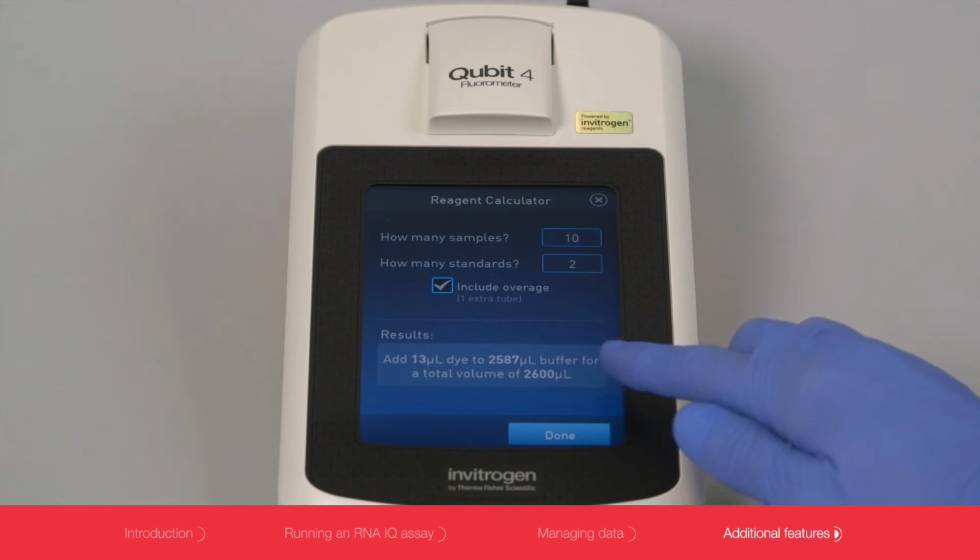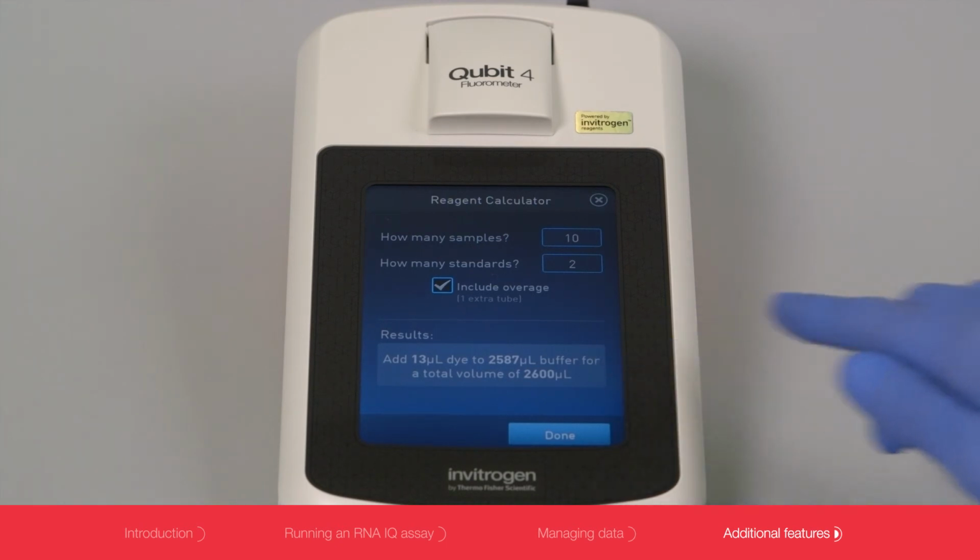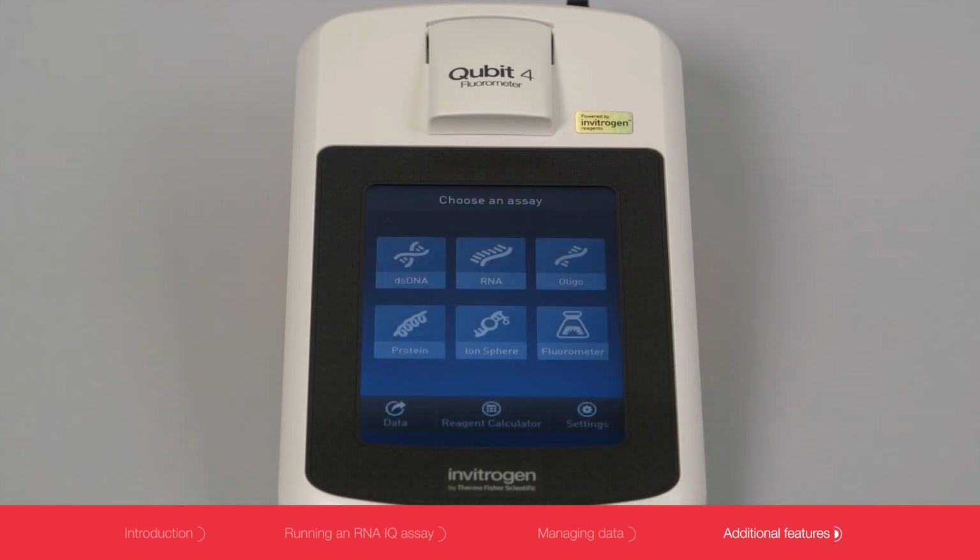The instrument indicates how much dye and buffer are required for the total amount of tubes. Using this tool on screen, you can modify the selections.